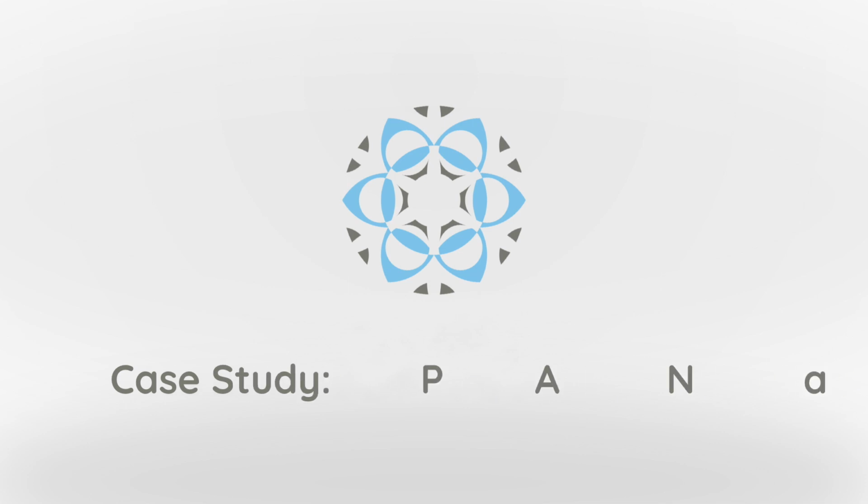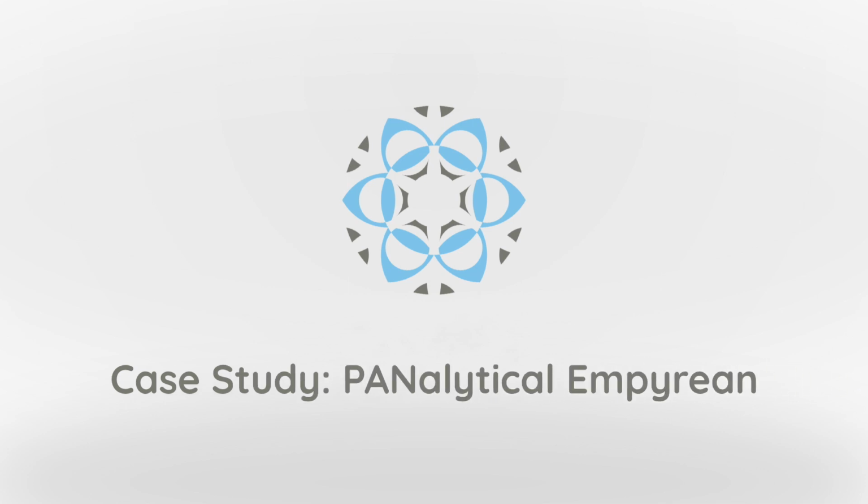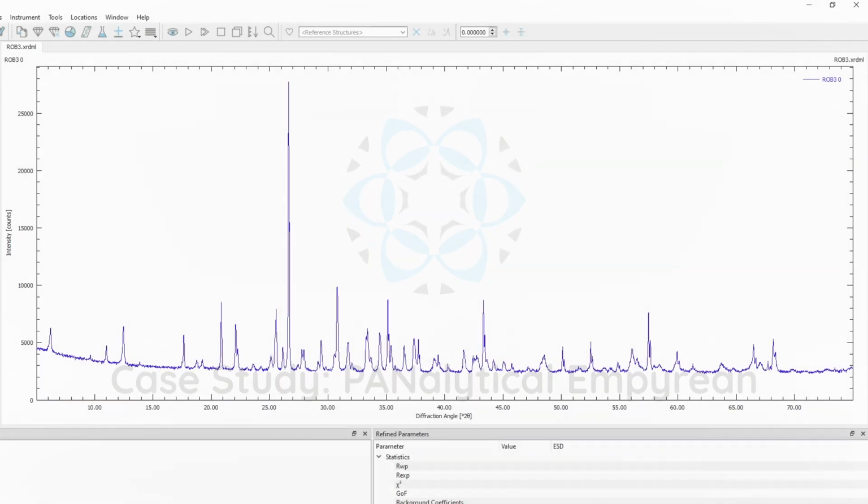Welcome to another case study. Today I want to process this dataset of a basalt sample. It was provided by a Profex user and it was measured on an instrument configuration that is not included in Profex. So before we can refine this pattern, we need to create a new instrument configuration, and this is what I will do in the first part of the case study. In the second part, I will actually refine the basalt dataset.